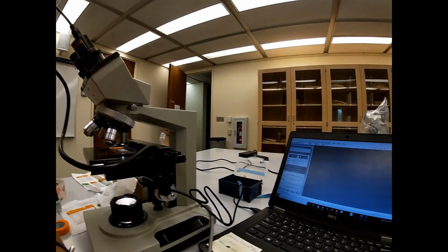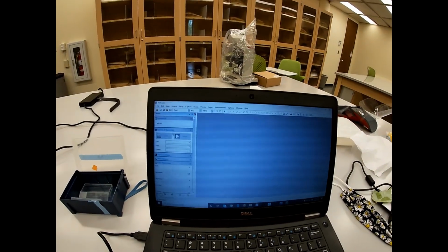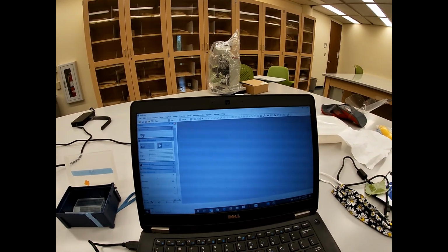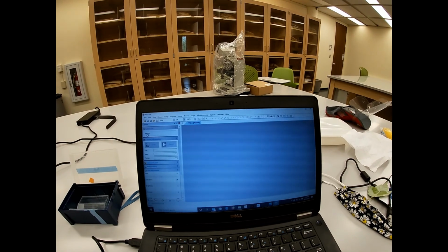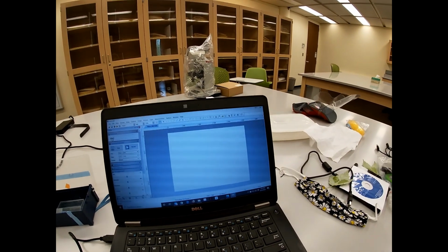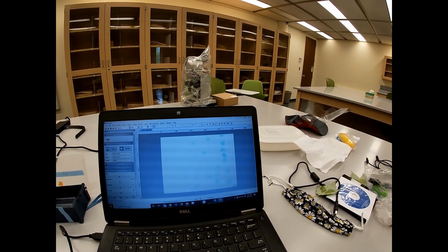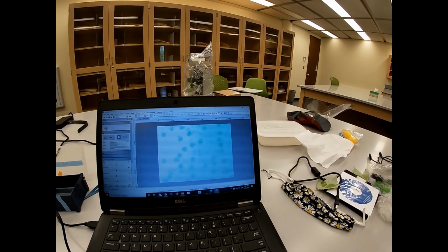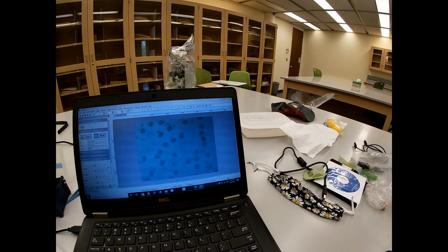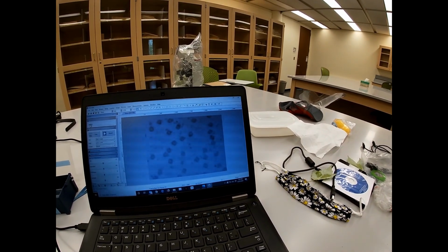Now we're going to rotate this around and I'm going to show you the camera. This is what it's going to look like, and you're going to have Microscope, camera list, and we're going to go ahead and click on MD500, and that's this camera. It's going to show me, eventually, an image of what is under the scope. And this is only a fraction of what you're going to see. But you can see that there are some images, and I'm going to actually bring those into focus.